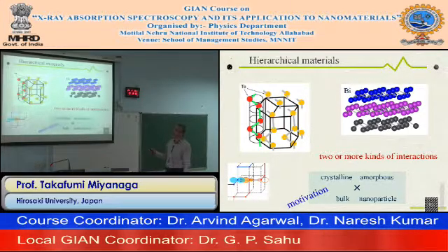So our question is how these interesting hierarchical structures change in nanomaterials. Of course, these materials have an amorphous state even in the bulk state, but the relation is very complex: crystalline, amorphous, and bulk, nanoparticles. That is our motivation.